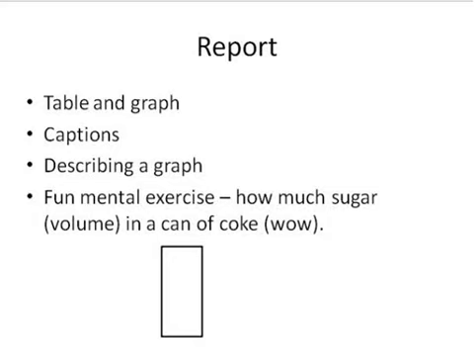The graph, we've also got some examples of graphs there, so you can look at those examples, and you should be able to create a graph within Excel and pull it directly into the Word document. Make it fairly large so that it's easily readable for the TA. The directions say something like half a page. That's a pretty good watchword. And you can typically embed that graph within the text, so you can put text around it, including the caption.